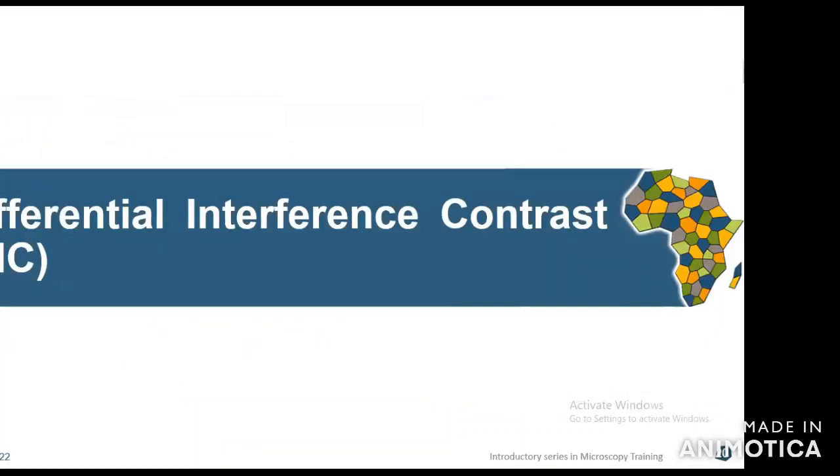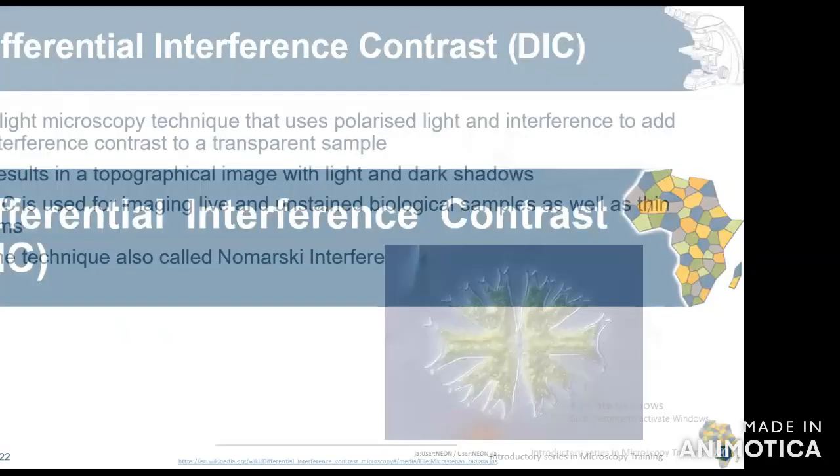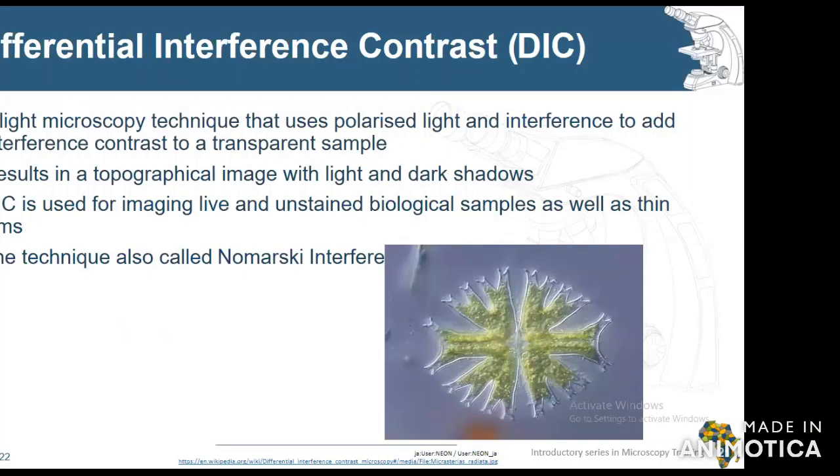Now, going to differential interference. Differential interference is another technique that can be used for live or unstained samples. It is also used for live sample imaging.